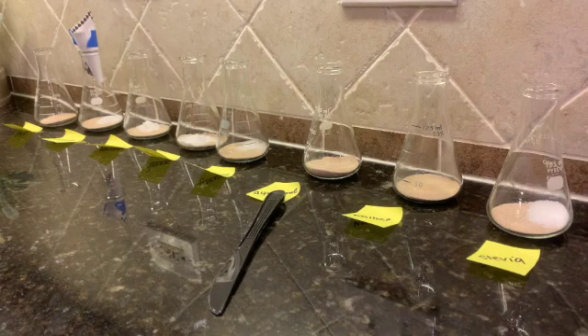Hello everybody. So today we're going to be setting up our sugar fermentation lab using balloons. We actually have a variety of different types of carbohydrates that we're going to be using. The idea is to go ahead and just see which carbohydrates work best in fermentation and which carbohydrates are less effective.